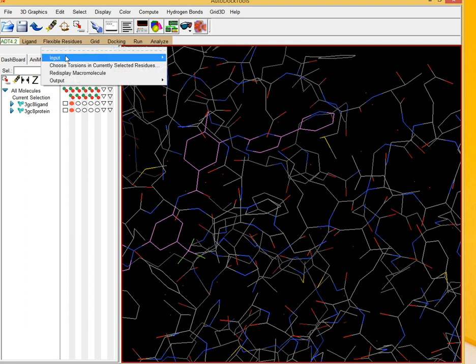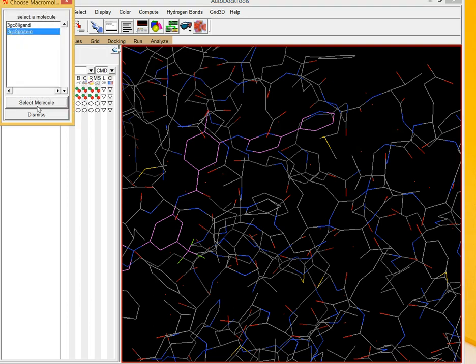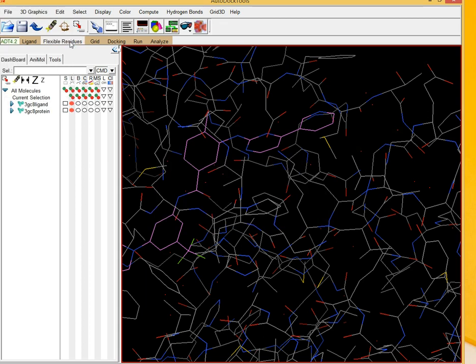Now let us see. Input, choose protein, select molecules. Choose torsion. Now you have to select, let us say, this amino acid.